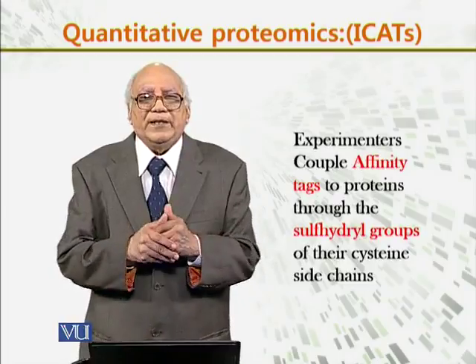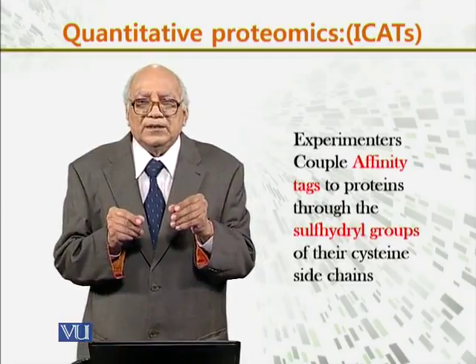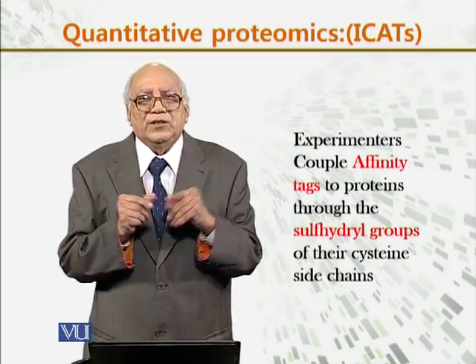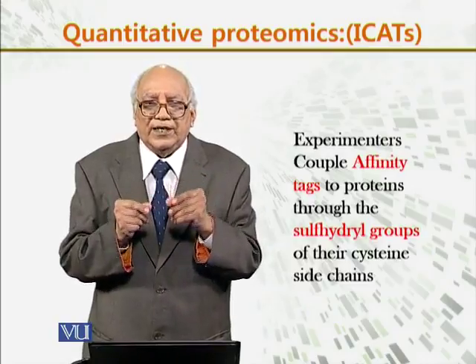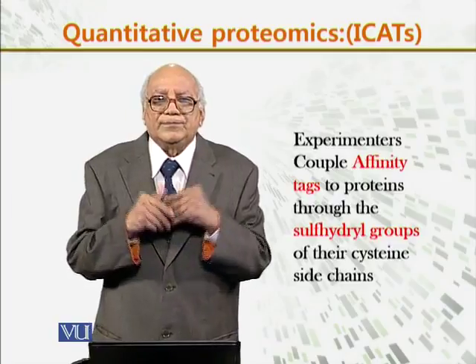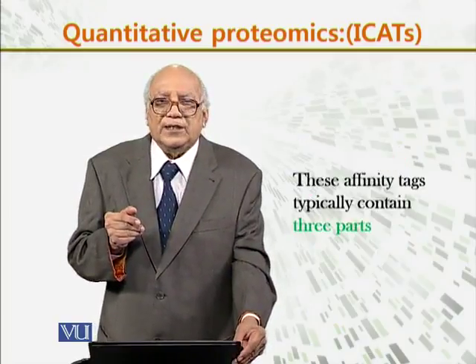Experimentally, they couple an affinity tag to the protein through the sulfhydryl groups of the cysteine side chain. The sulfhydryl group of the amino acid cysteine is tagged with the different affinity tags which are made.